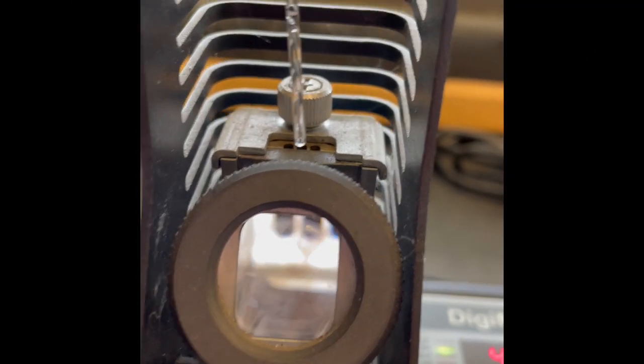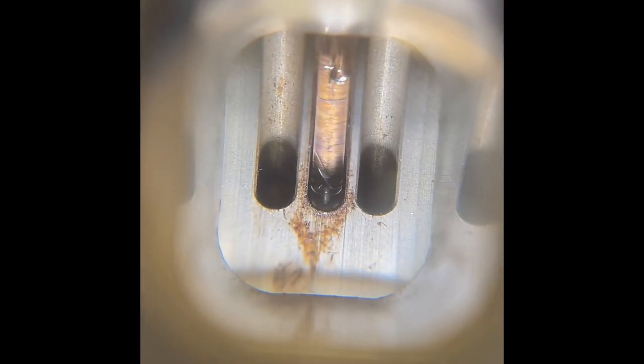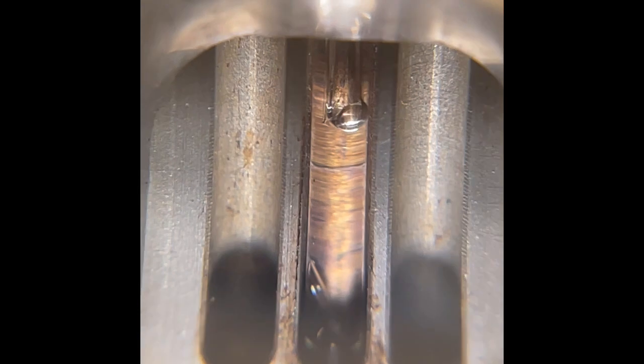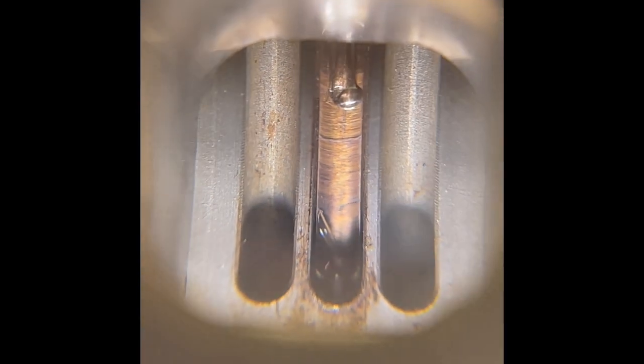Let's see how it actually works. You might be able to see the capillary microbell inside of this capillary tube. But I'll put it in there. Let's see if we can zoom in. So you can see the bottom of it. It's kind of floating up at the top, right? It's kind of where that bubble looking thing looks like it's at the top. And then there is a broken piece of glass on the bottom, but like, who cares, right? Whatever, get off my back. So I tried. Okay, so I'm going to go ahead and start it.